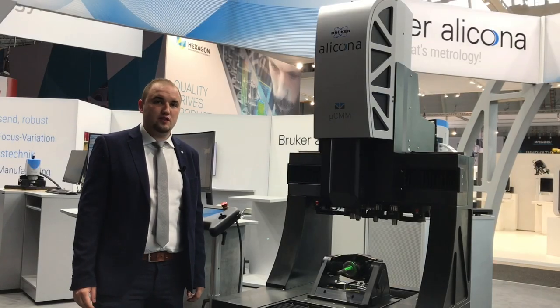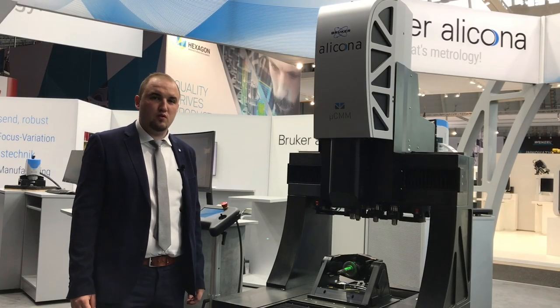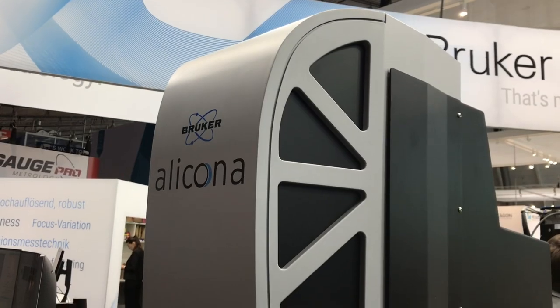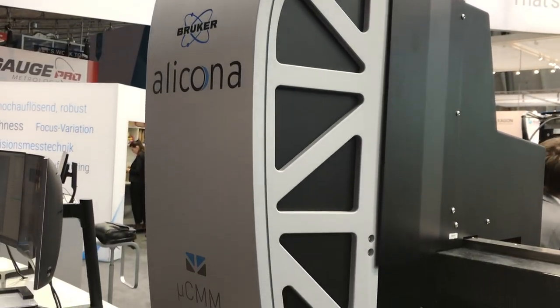My name is Kevin Matti. I'm an applications engineer at Bruker Alicona. Today I would like to introduce our MicroCMM micro coordinate measurement system to you.